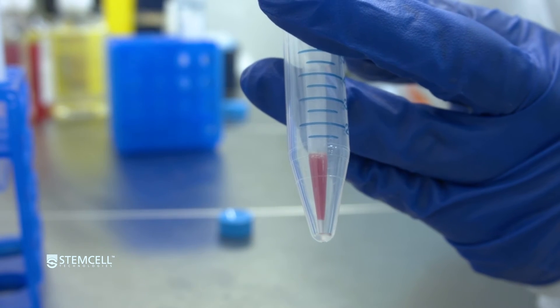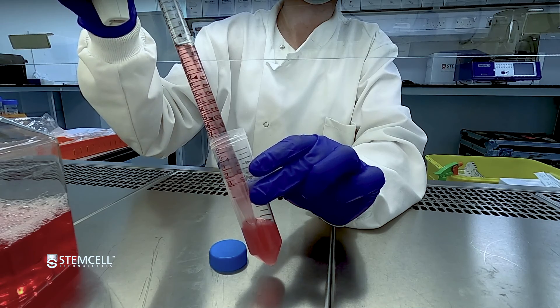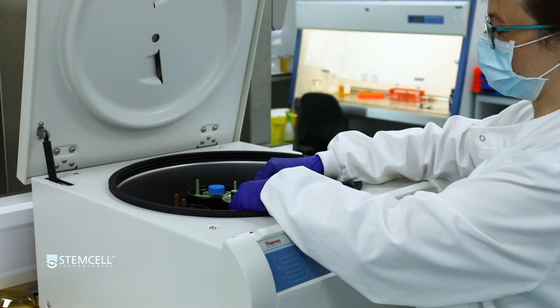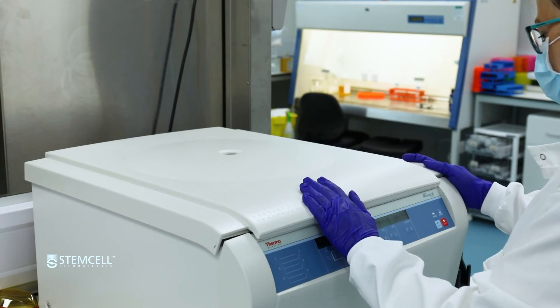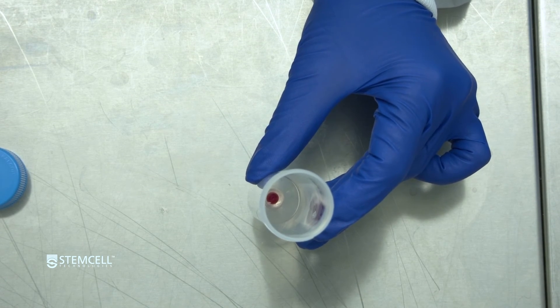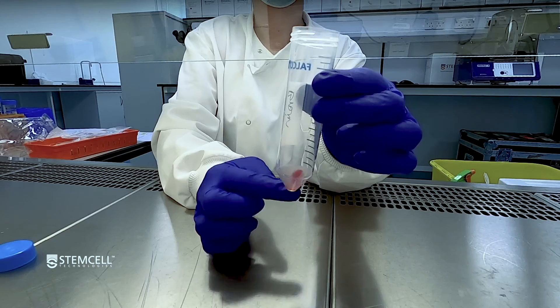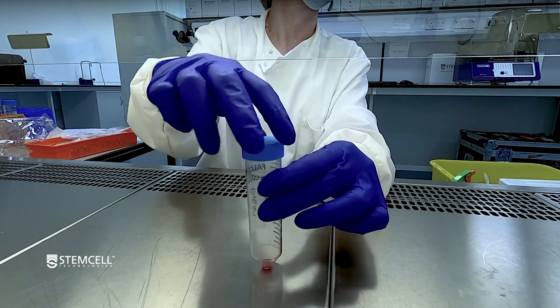Transfer the cells to a new tube and top up with sample preparation medium. Centrifuge at 300 times G for 10 minutes with the brake on low. Carefully remove and discard the supernatant. Gently tap the tube to dissociate the cell pellet. You now have a single cell suspension that is ready for cell counting and downstream cell isolation.